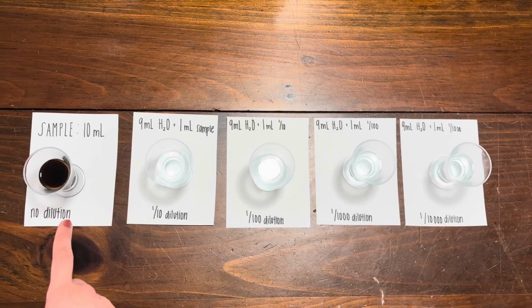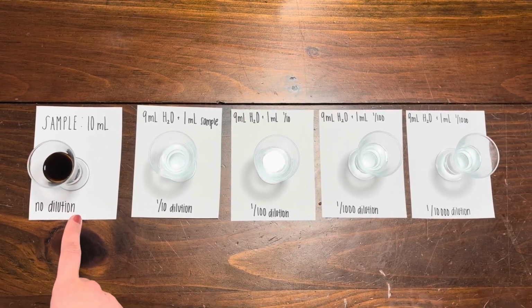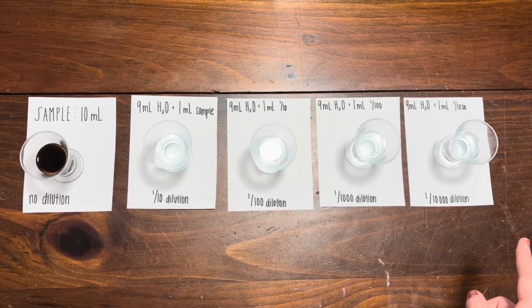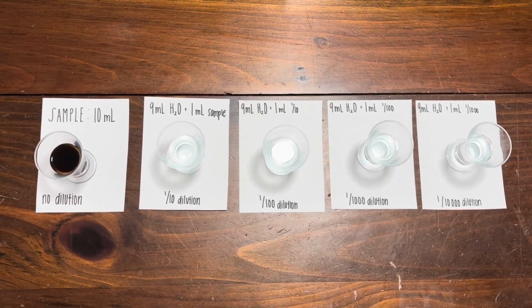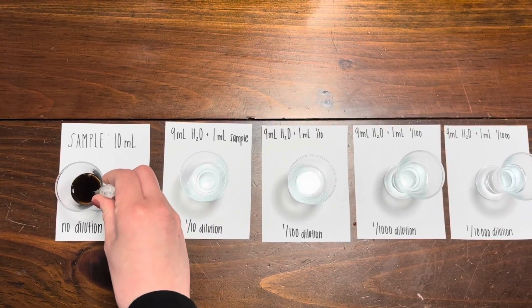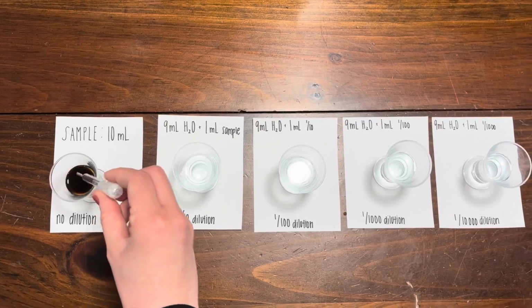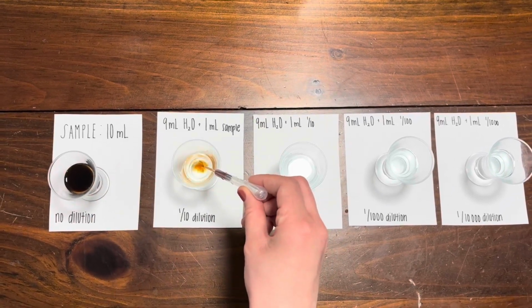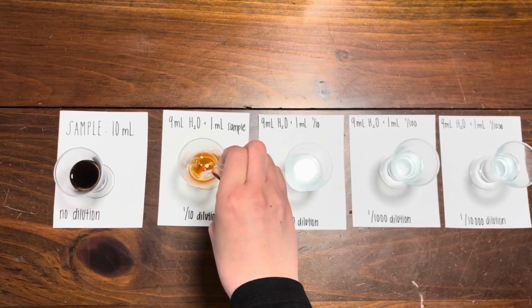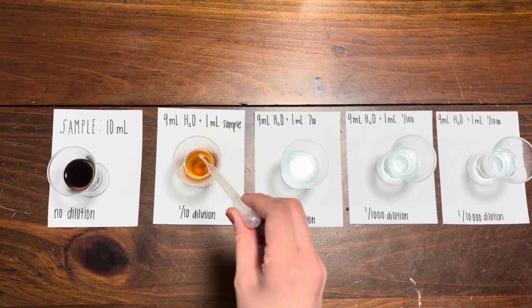So we have the first container, which has 10 milliliters of coffee. This is not diluted. We have 9 milliliters of water in each of these cups. So we will be doing a serial dilution. So I will take 1 milliliter of coffee and transfer it to the first container. Mix it a bit. And this represents a 1/10 dilution.